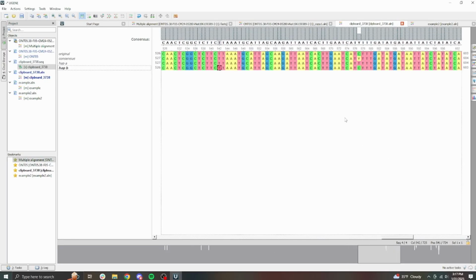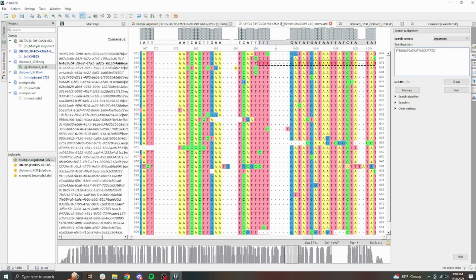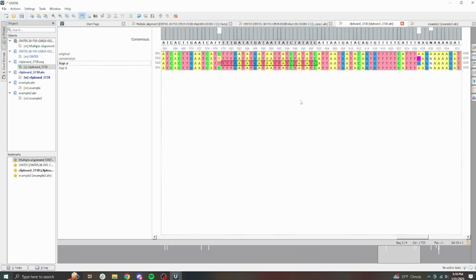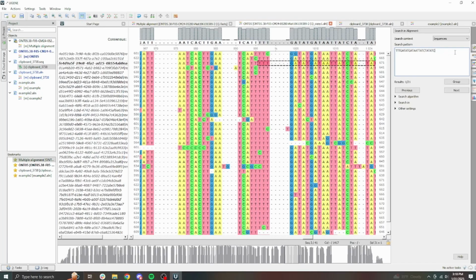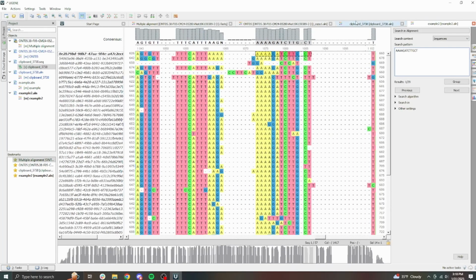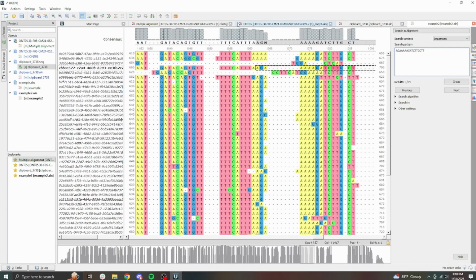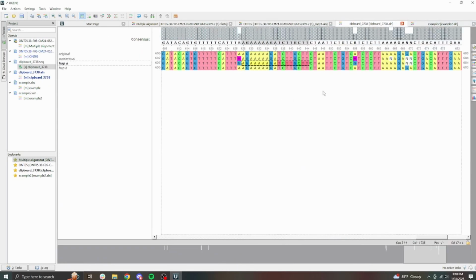To see what is going on with the alignment, we're going to find the actual ambiguous positions. That's a T. And it's a C, so it's definitely a Y. And basically my goal is I just want to try to have the most accurate data that I can. It's not going to be perfect, but we can do our best. And that's okay. So that's definitely an A. That's an A. That's a G. So that's an R.